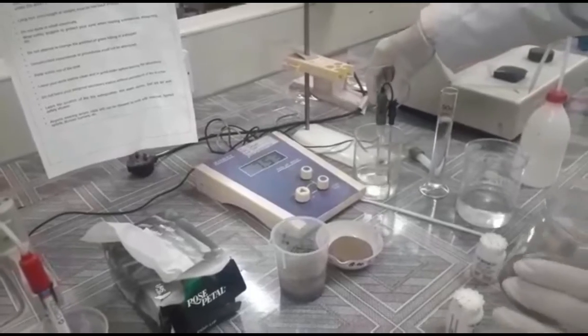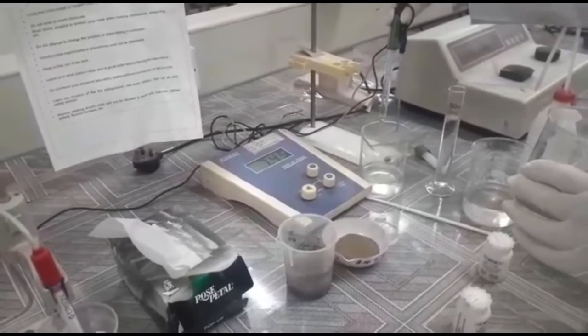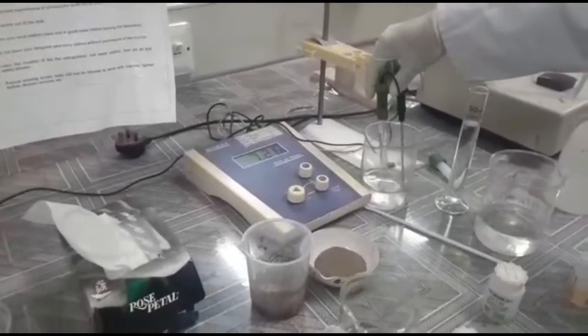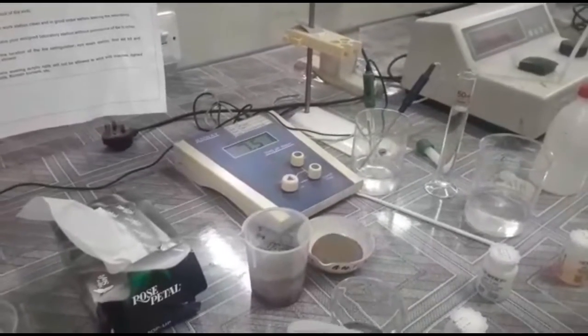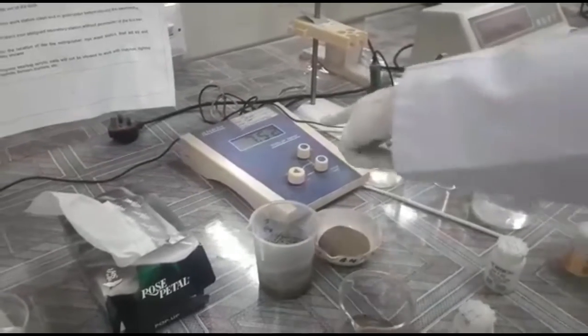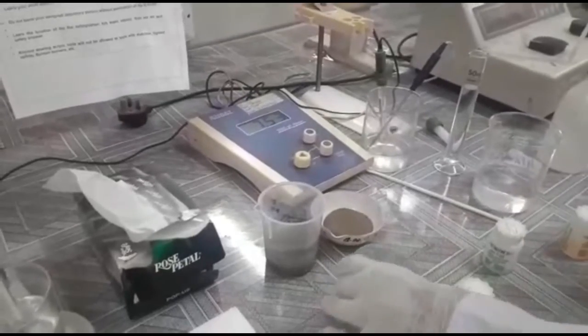Then we will dip the measuring rod of the meter into the solution and check the pH. We will wait for a few seconds so that the pH reading is really stabilized.